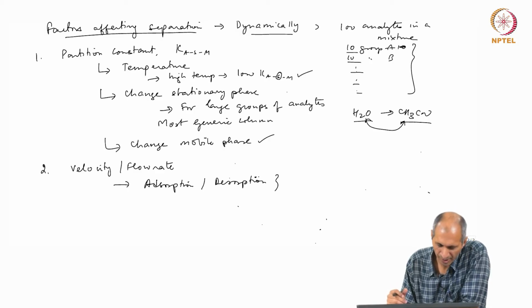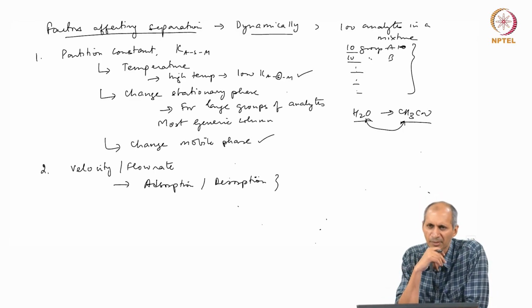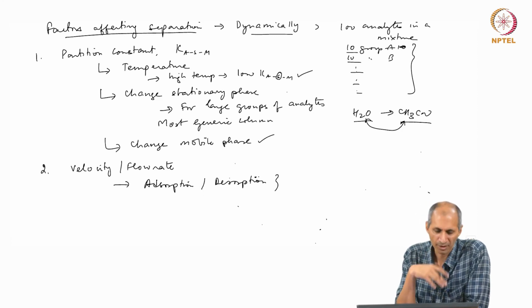for the analysis. So, people have worked a lot on chromatography. If you look at the literature on chromatography, or if you take a catalog of any chromatography system, the companies designing chromatography systems are all working on this currently. This is all very old.